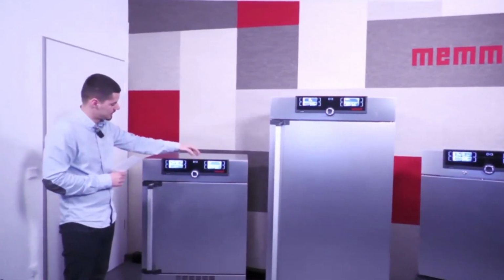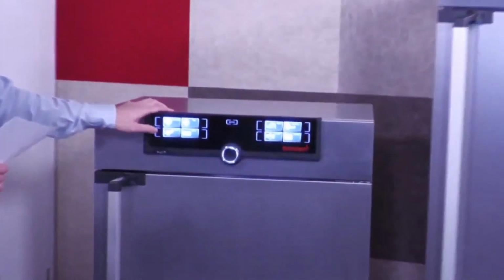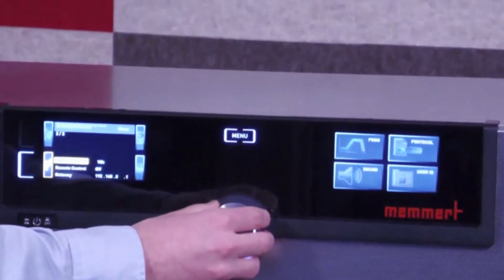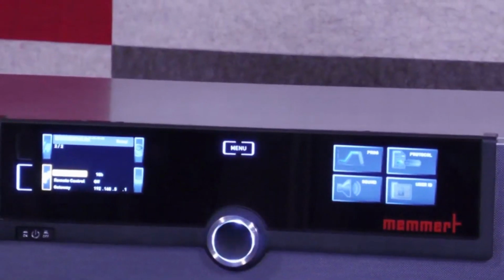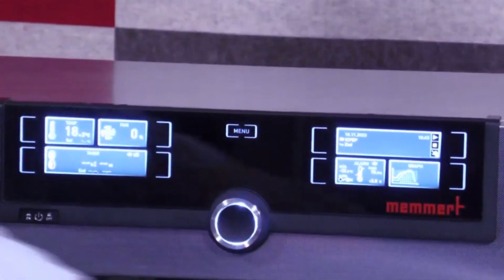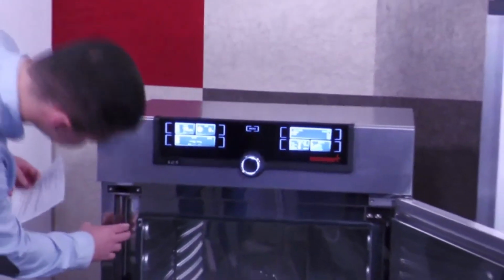And also, I can show you the defrost function, which you can find on the menu, and then set up, and then turn down. And there you can adjust your defrost function. The ICP is equipped with an inner glass door, as you can see here.